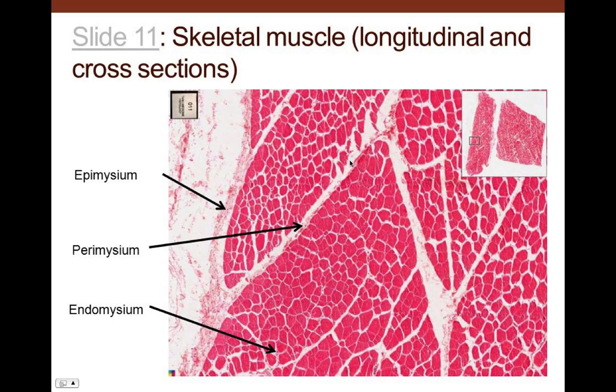And then we are going to be putting a stronger connective tissue around our muscle fibers. That is going to be our perimysium to make fascicles. And this one's showing you the epimysium. This is going to be on the outer edge, wrapping around the total muscle. Most of our slides in the classroom, unless you happen to get this exact part of the muscle where you're seeing the outer layer of the muscle, most of the time we are not going to be able to see the epimysium. But we'll see lots of perimysium and endomysium.